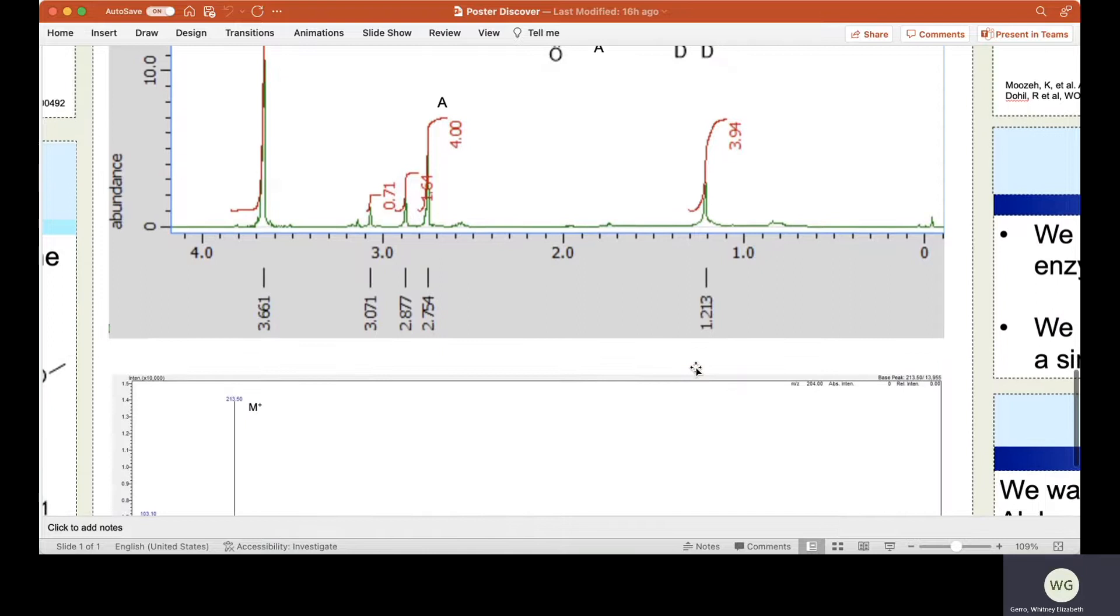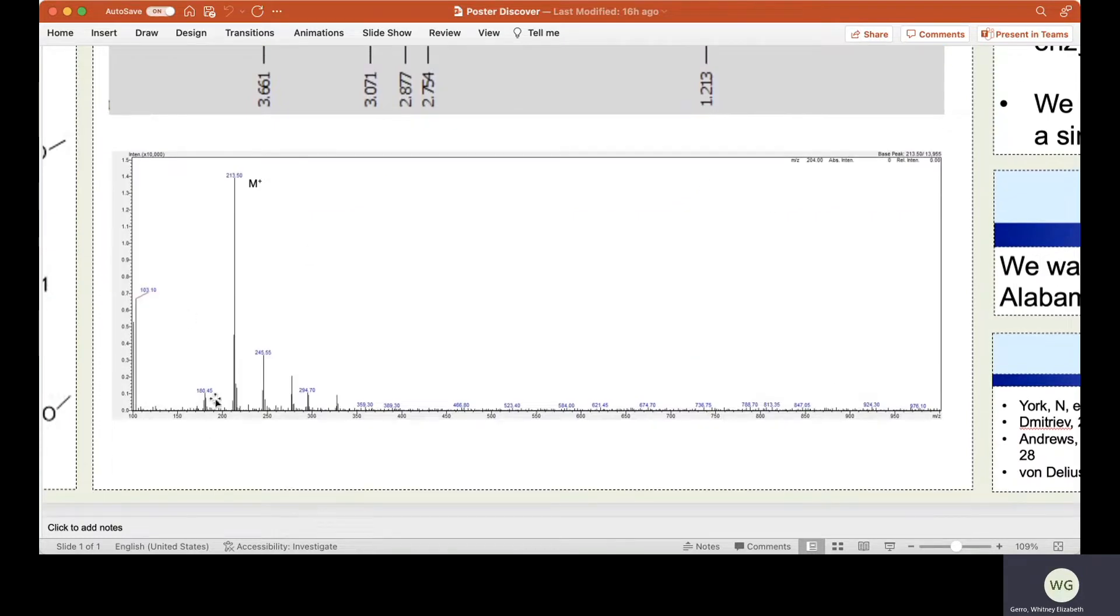Our NMR spectra is corroborated by our mass spectrum. Here, we have our base peak at about 214, which corresponds with our deuterated molecule. However, we likewise see other peaks that we cannot account for.